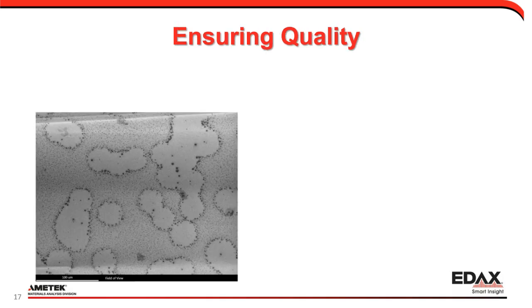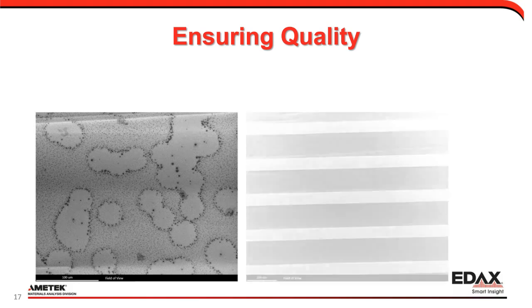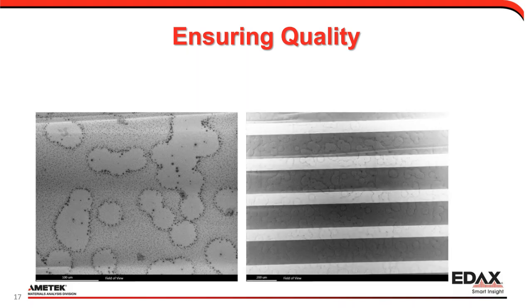So many companies do failure analysis or quality control. And this example here is one example of quality control. And it's quite an interesting example. So I wonder if anybody has a guess of what we might be looking at. You might notice the droplet appearance, maybe some type of oil or contaminant. And I'm going to zoom out to a lower mag, and maybe now it becomes more apparent what we're looking at.